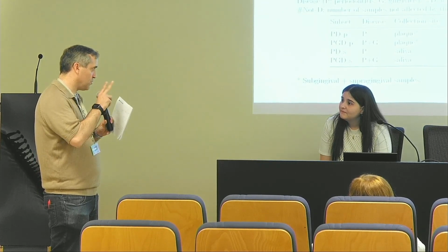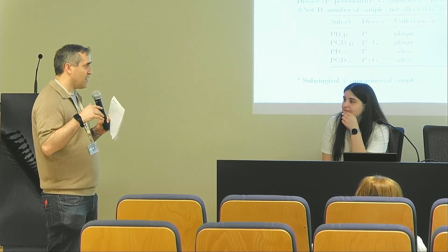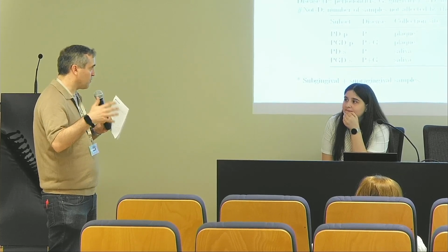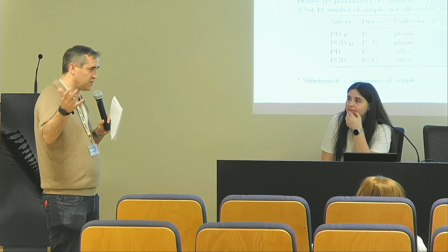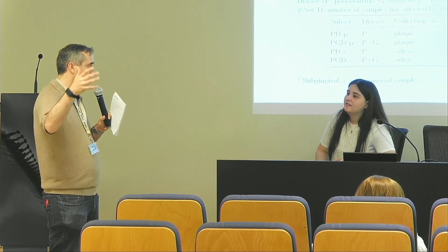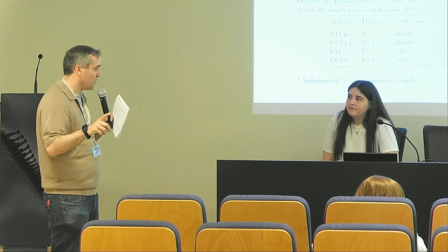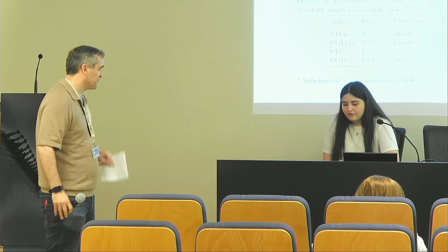Well, I have actually two more questions. So one is, have they tested your software, or are they intended to use it? Or is this intended to be integrated into something that they can use easily? Or what are the expectations? So, for the first objective, which was PrimerValpi, we did a study to find the best primers to amplify bacteria and archaea in the oral cavity.